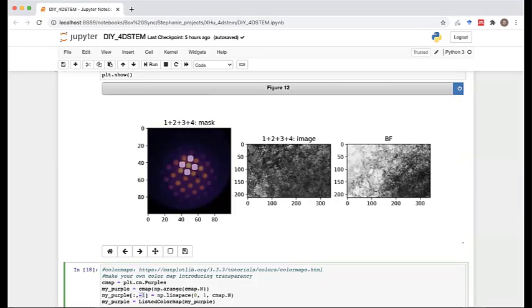And there was a comment I mentioned earlier about other packages, right? For example HyperSpy or 4D-STEM packages. They do have functions built in. The idea here, and what Stephanie is demonstrating, is that you can do it yourself. You can just go in and modify those functions to answer the questions of your sample. Right? Yeah, totally. All these packages can do some very similar things to what we've done here, but there are different challenges when it comes to writing your own code and the learning curve for that, versus understanding someone else's code and the learning curve for that. So it depends on what you want to do and what you need for your analysis.